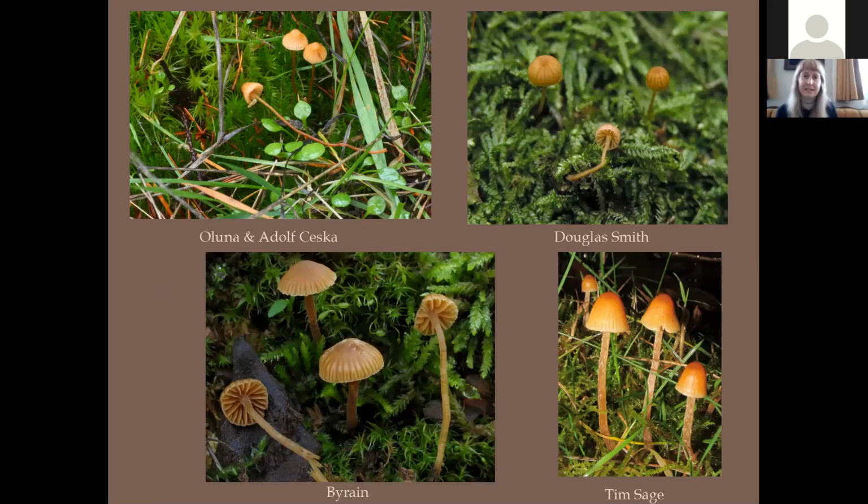Okay, so here's an example of that first situation where you have a whole bunch of different species that basically look the same, but in theory, each one of these little brown mushrooms that I'm showing you is a different species within the genus Galerina. However, if you put each one of these things under the microscope, you're going to find that they look quite different.